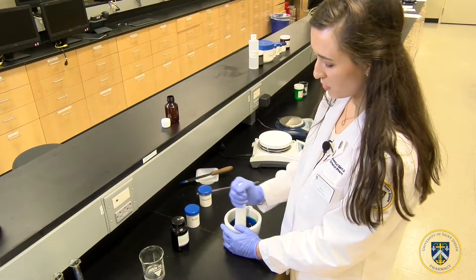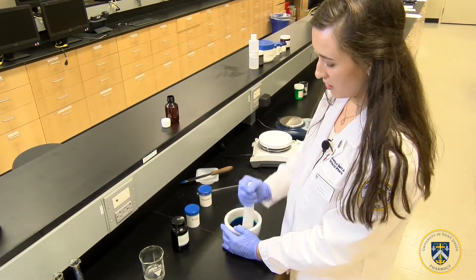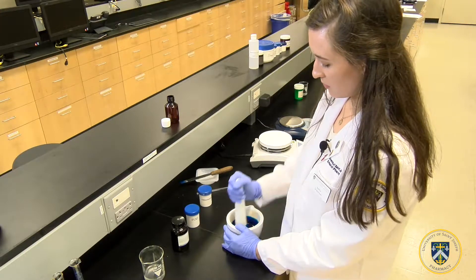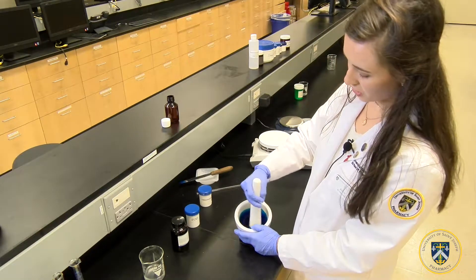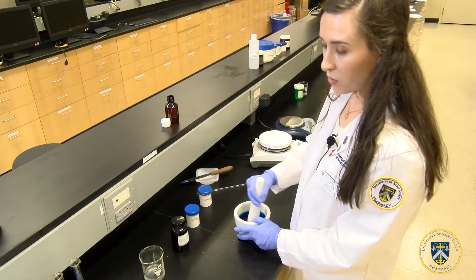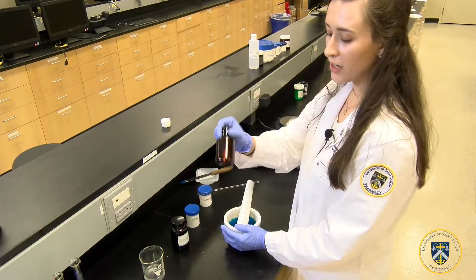You can use a little bit more force to make sure that it does become jelly-like in nature, and now that this is of a jelly-like consistency we will transfer this suspension into our calibrated amber vial.